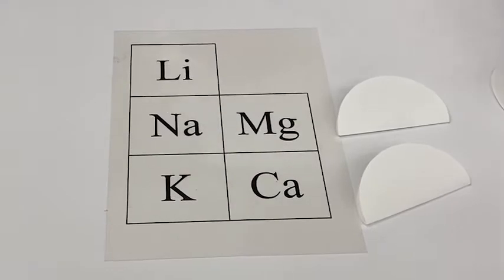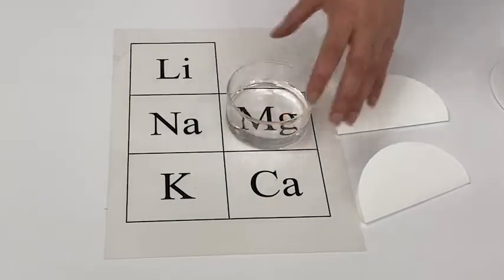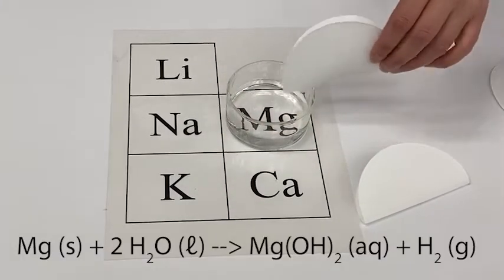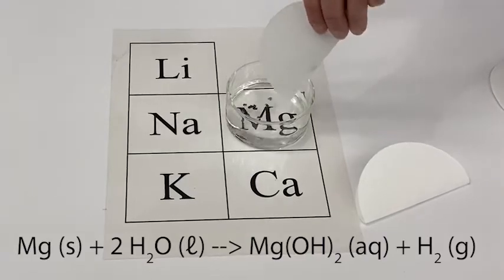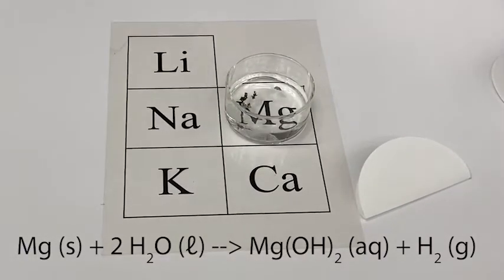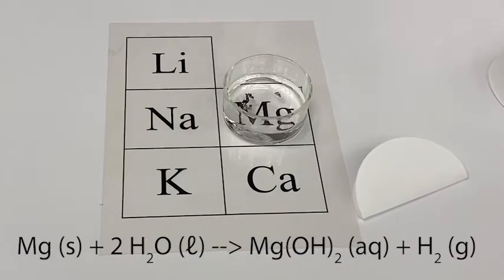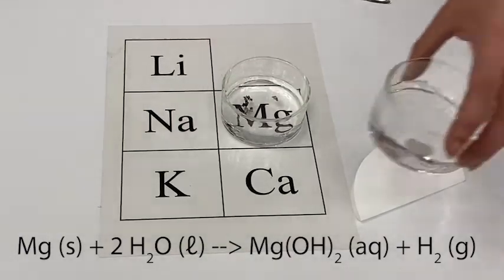Now let's take a look at the alkaline earth metals. We'll start with magnesium. You can see there's not much of a reaction, but let's take a look at calcium.